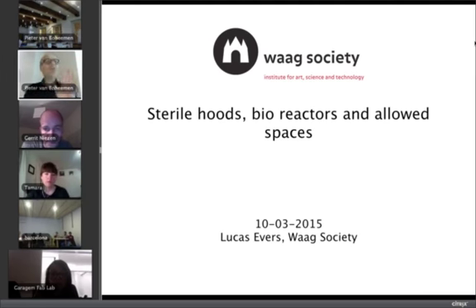As I understand, you're all working on making a sterile cabinet. I'm going to say a few things about that from an arts perspective, but also starting from the question, what is a sterile hood? And together with that, I also do a little bit of a reflection on what is a bioreactor. Because if you ask me, there are two similar sorts of enclosed spaces. They're built not to let certain living things in, and or not to let certain living things out.